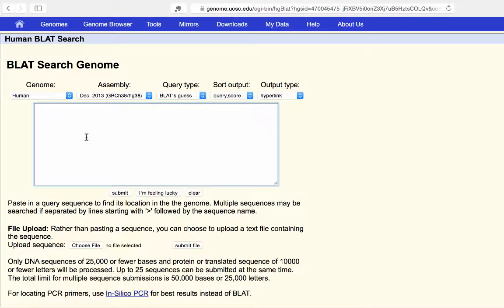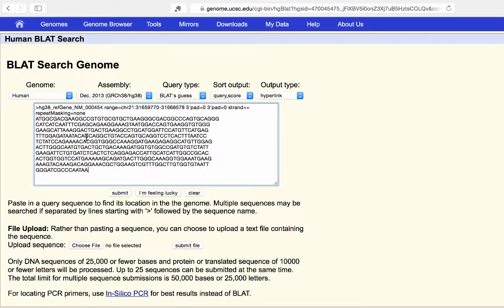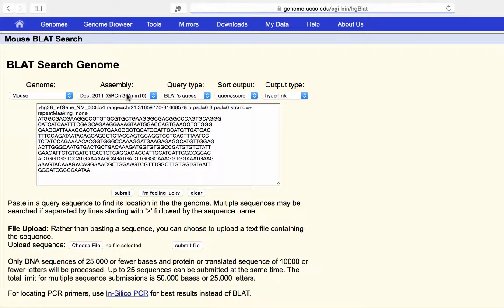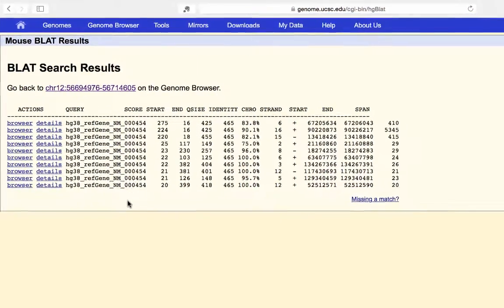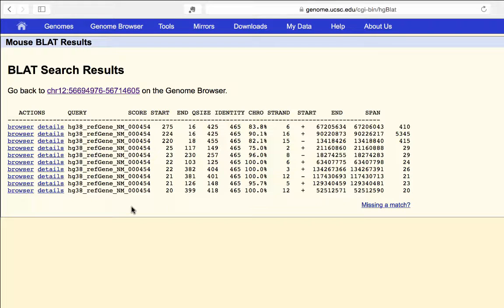Let's copy the SOD1 sequence and paste it into BLAT. We're going to search the mouse genome to find a corresponding gene in the MM10 assembly. We'll set the query type to DNA and click Submit. You can see a number of results — BLAT tells you how good they are, ranked by score. The header and columns are slightly offset, but this is the score column.